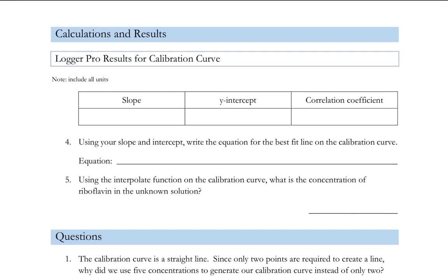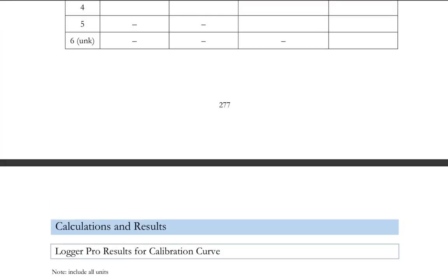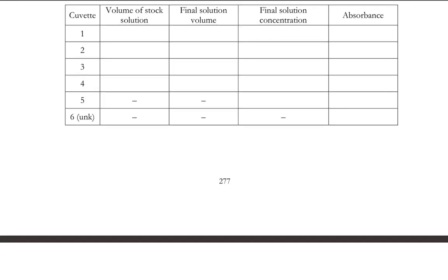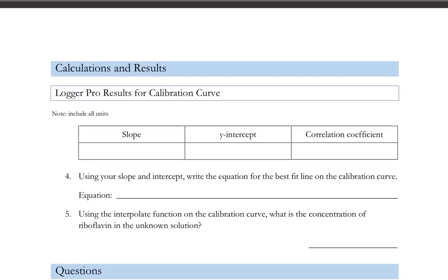So back up here, you have the absorbance of your unknown. That's cuvette 6. You have its absorbance. Here in step 4, you have an equation, A equals number, C plus number. You put the absorbance in there, you do some algebra using your slope, your y-intercept, do the math correctly.